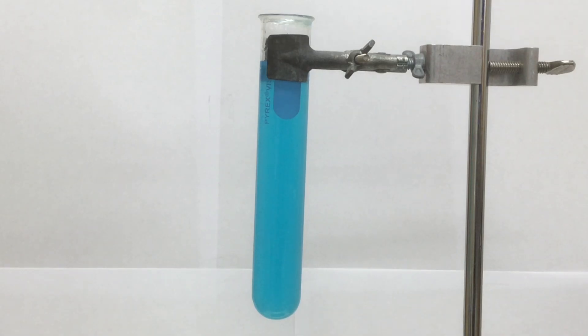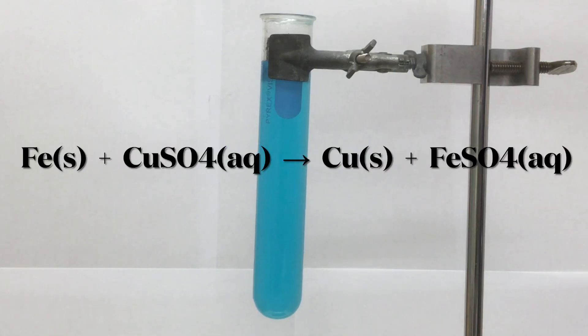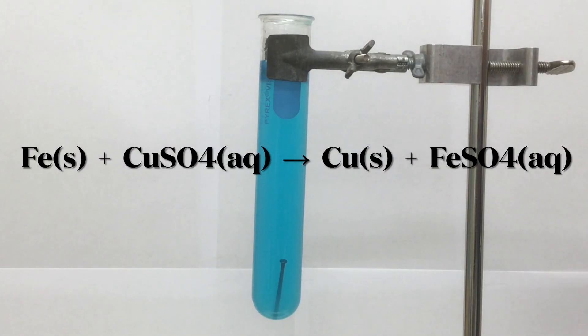Hi everybody, welcome back to Chemistry. I'm Jeremy Krug and today we're watching a single replacement reaction where we're taking this beautiful blue solution of copper 2 sulfate and adding some iron in the form of these wire nails.